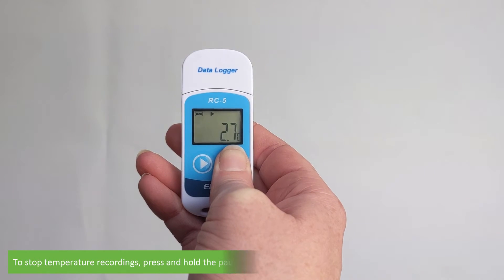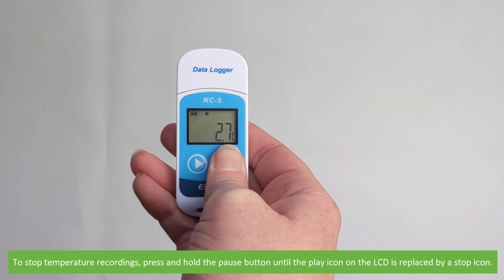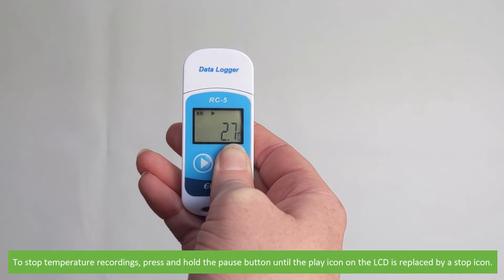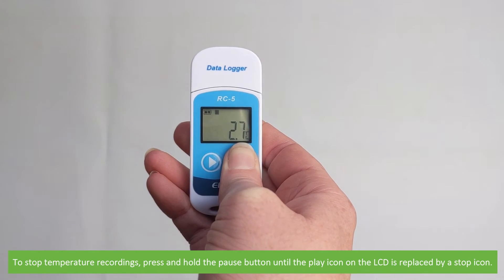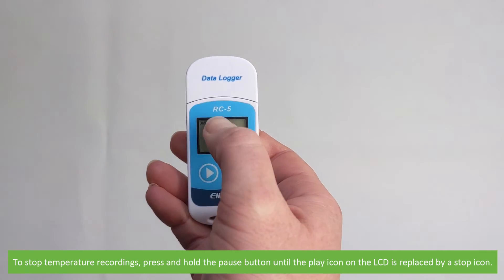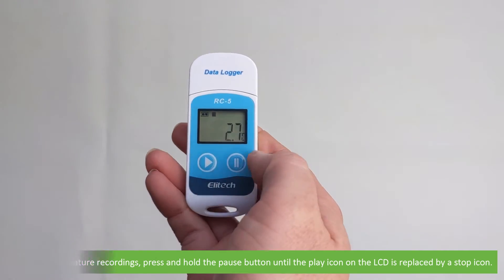To stop temperature recordings, press and hold the pause button until the play icon on the LCD is replaced by the stop icon.